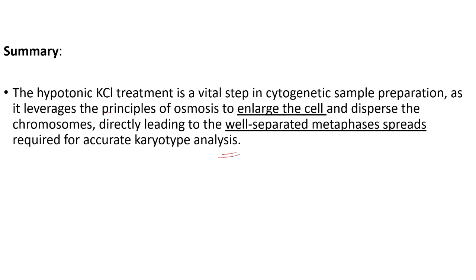So, due to hypotonic potassium chloride, through the process of osmosis, we get the enlarged cell, which helps in well separated metaphase spreads, which is necessary for accurate karyotypic analysis. So this is the use of hypotonic potassium chloride in cytogenetics.